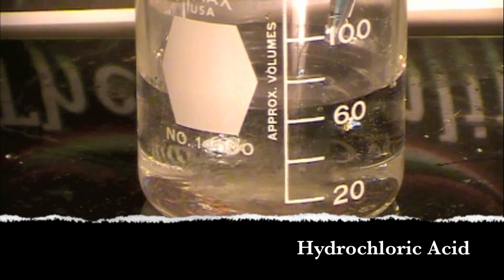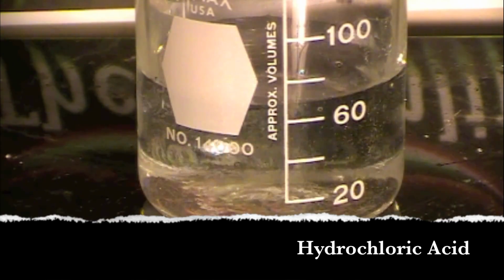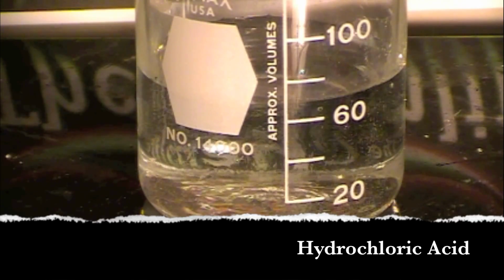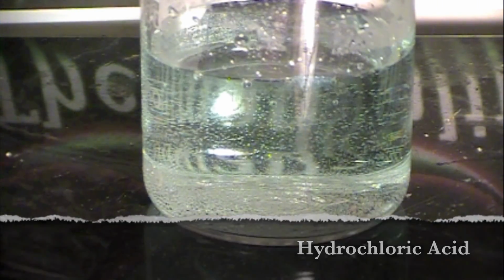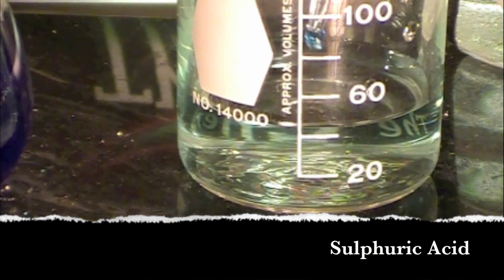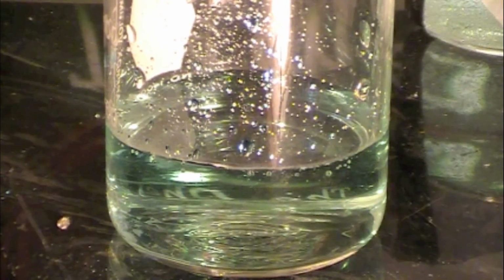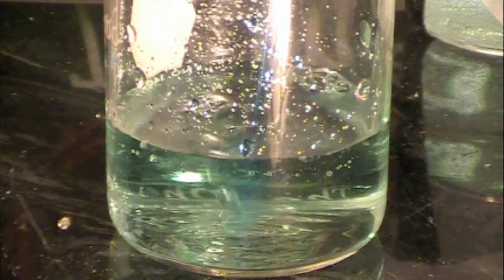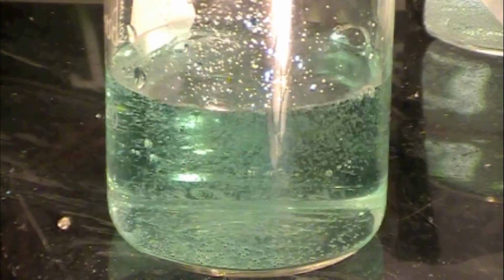For this next test, this is hydrochloric acid, and you can see that absolutely nothing happens. It just destroys the cellulose. Now the final acid is the suggested acid, which is sulfuric acid. It works significantly better, and you're going to be able to see that quite clearly momentarily, that as soon as the complexed cellulose comes in contact, very large amounts of fibers start to form.